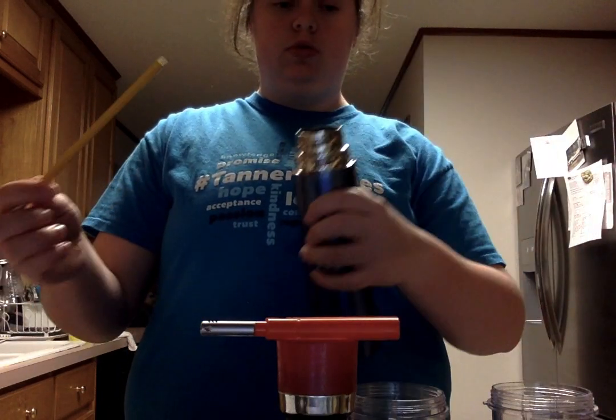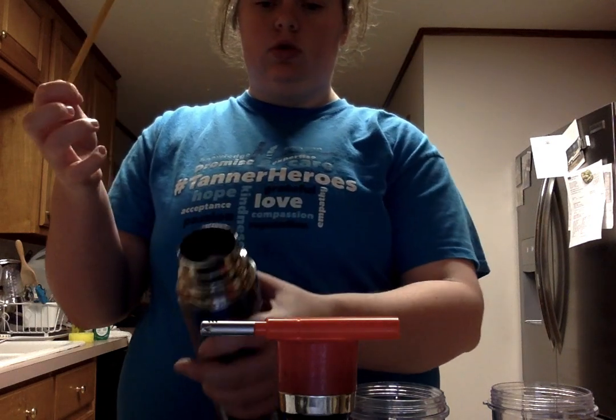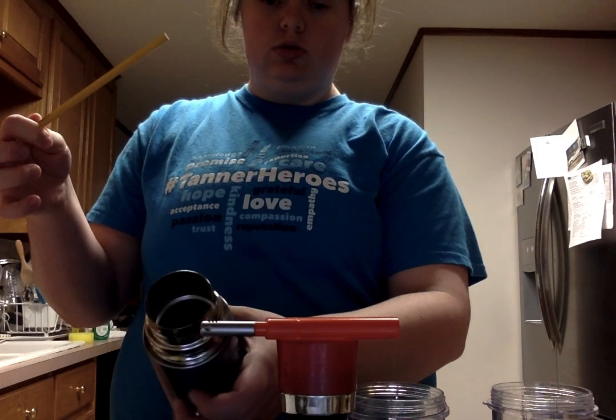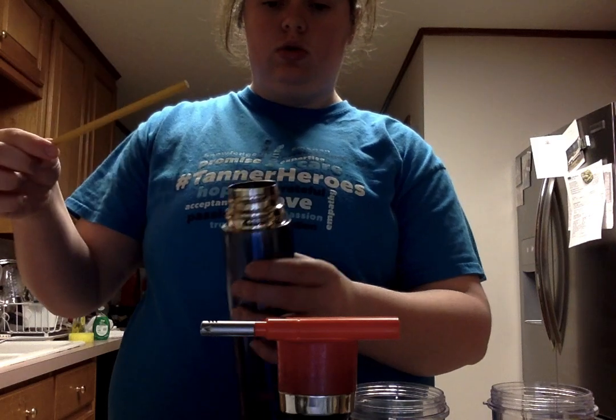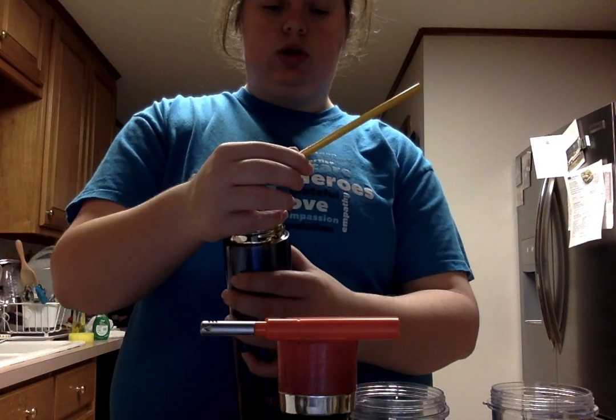I'll be taking my broth tube to get the bacteria, take the cap off, and sterilize the glass for 3 seconds. Then I'll take my sample, re-sterilize the glass, and put the cap back on.